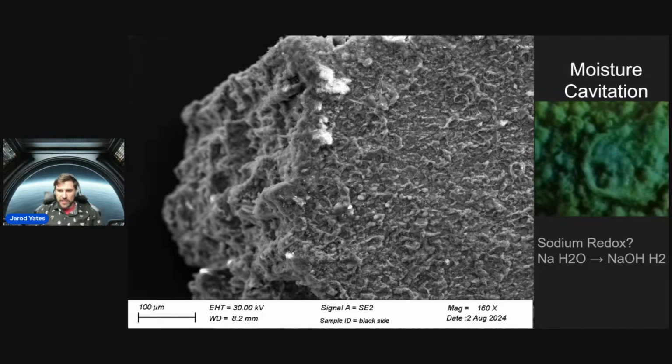Well, we can see a couple of spots, and in the next couple of slides, we'll note a lot more obvious where some of those spots are. But once again, indicating that this thing seems to react to water and produces some redox reaction.